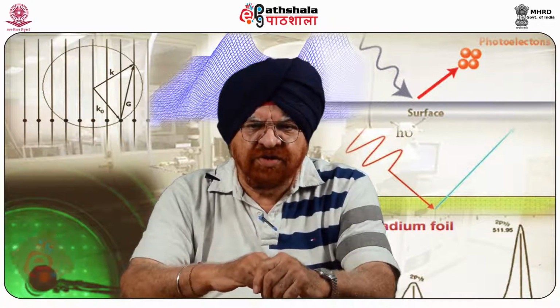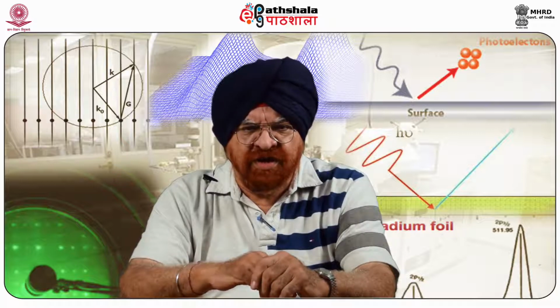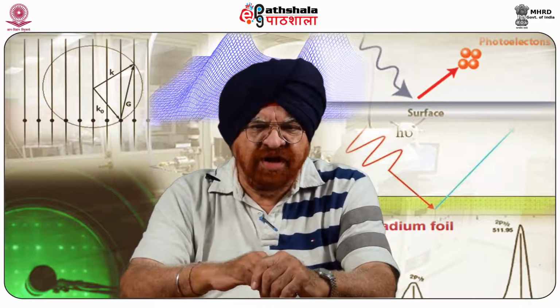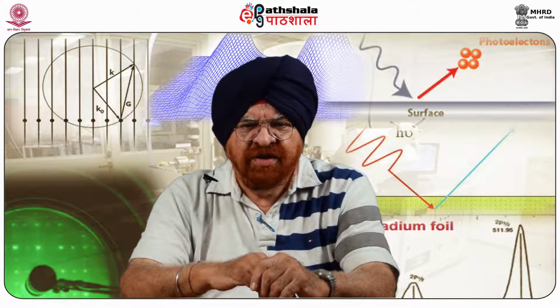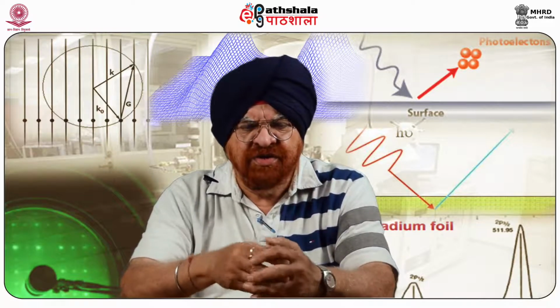Today we are going to discuss the module called Electron Spectroscopy for Chemical Analysis. It is abbreviated as ESCA, and this comes under the paper Surface Analytical Techniques Part 1.